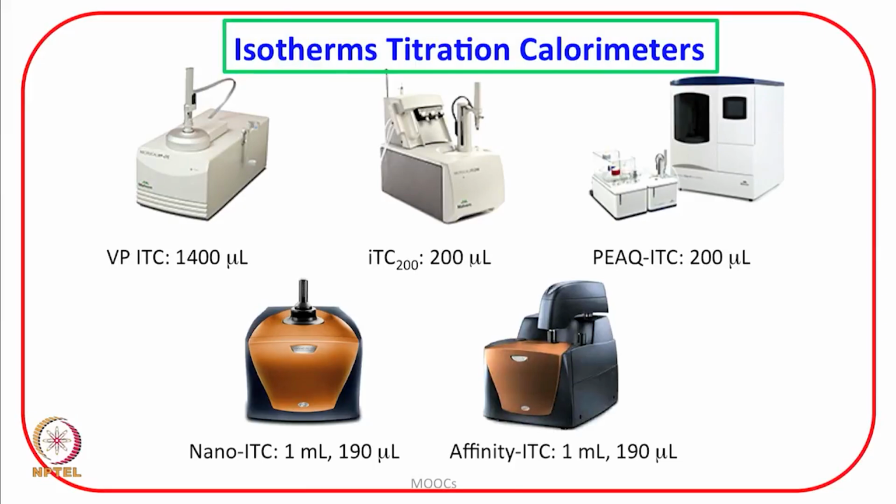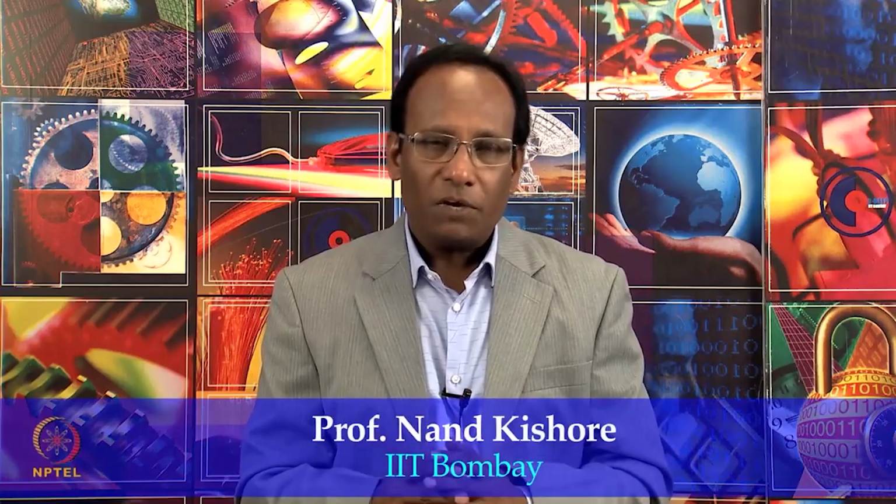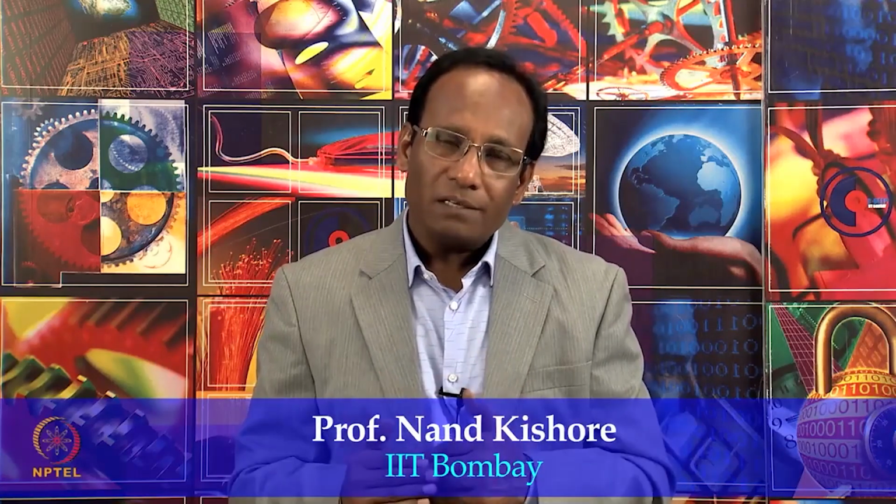So, what we discussed in this lecture is how to extract the different thermodynamic parameters from a single isothermal titration calorimetric profile, and that it is not just the number, the signs are very important to connect these thermodynamic data with the nature of intermolecular interactions.